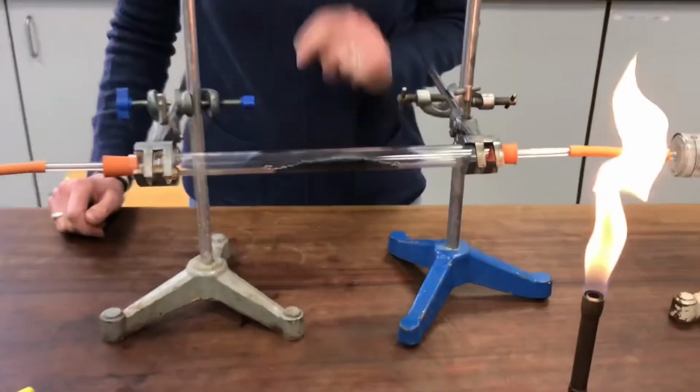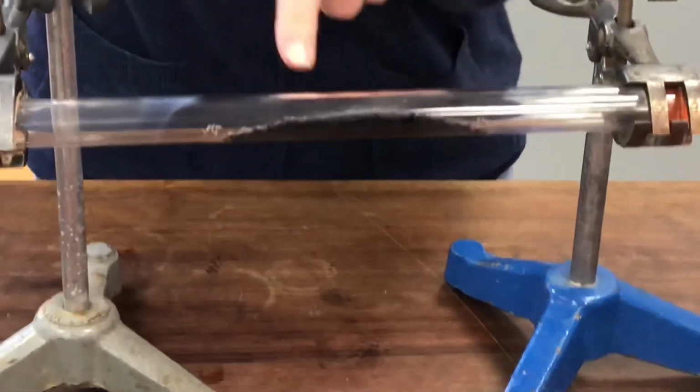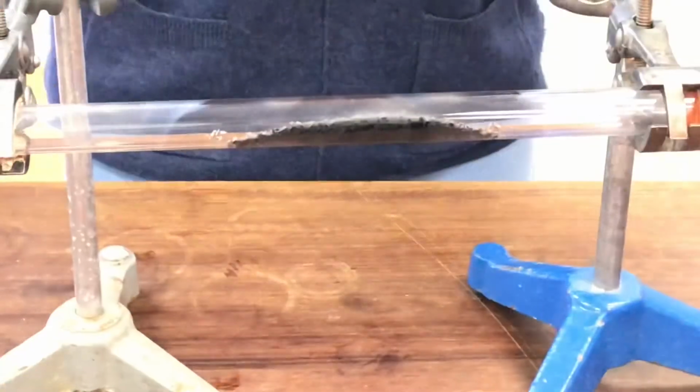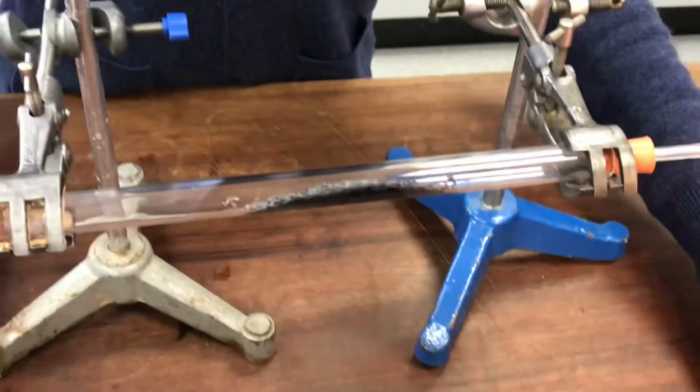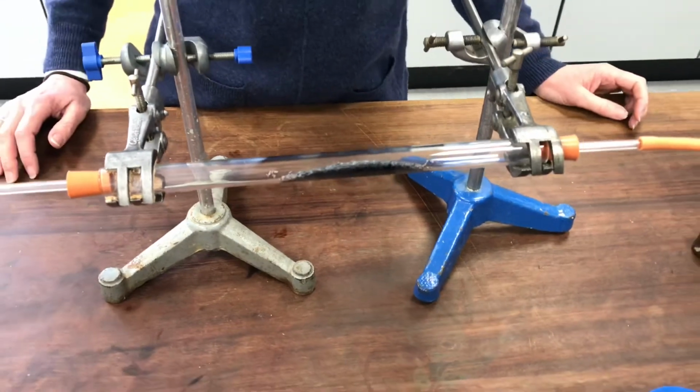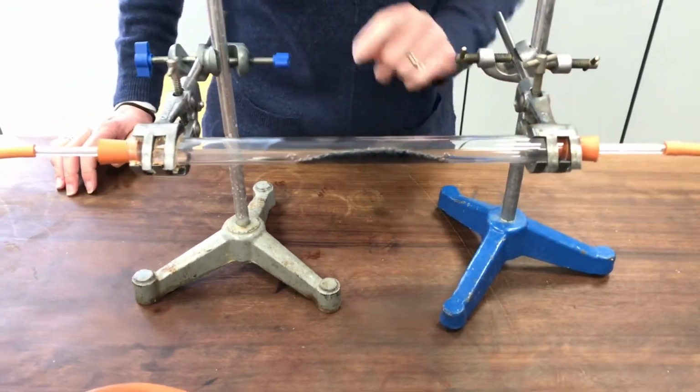The experiment is now finished, and I hope if you can zoom in and have a look at the appearance of the copper. It's all gone completely black, which shows that it's all formed copper oxide, which means it's used up all the oxygen out of the air that was in that system. Okay, so it's completely black.